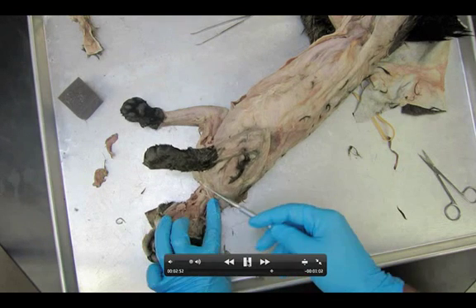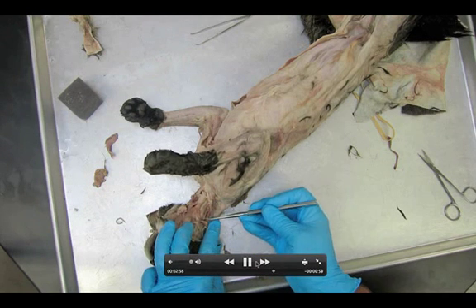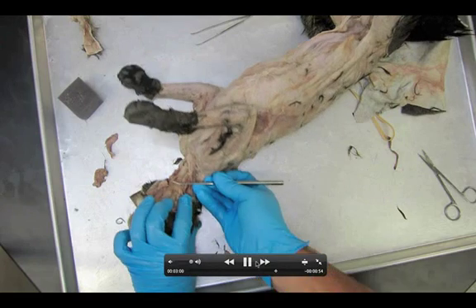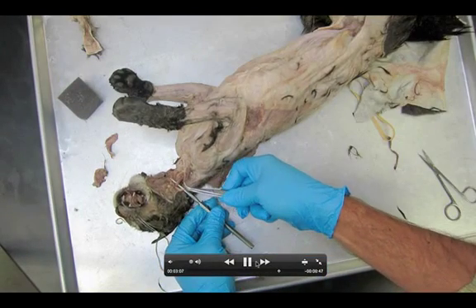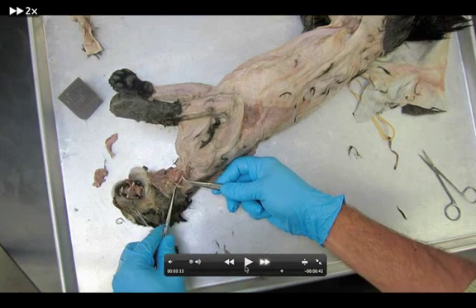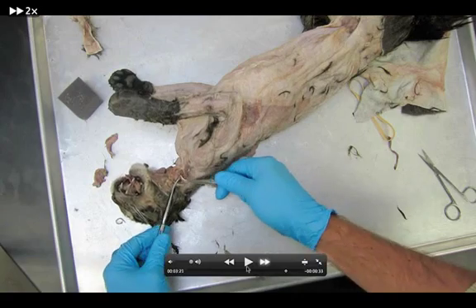The carotid artery is much deeper than the jugular vein. You might see a little nick in the carotid artery — a little hole that they put in it when they were draining the cat of its body fluids and then pumping the preservative into the blood vessels of the cat. I actually got my probe into the hole there — you can actually see it's inside the little gap.